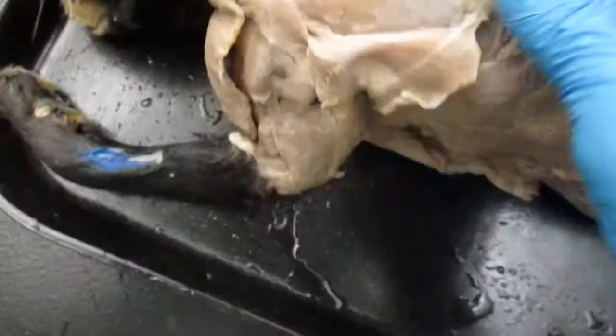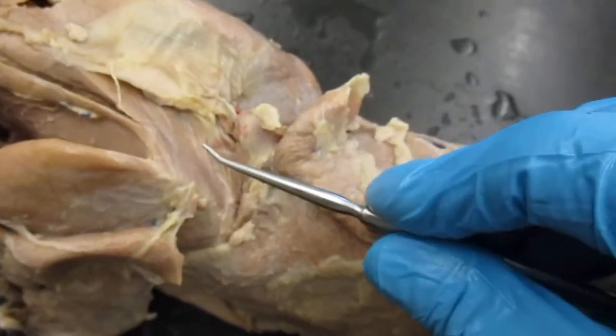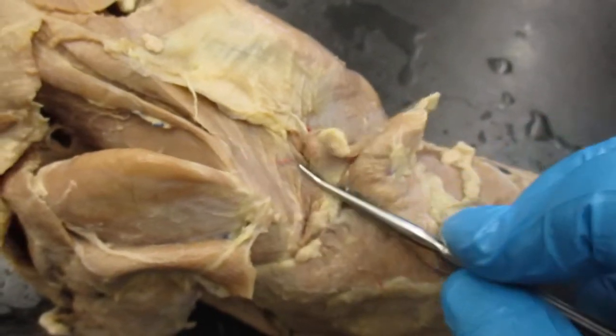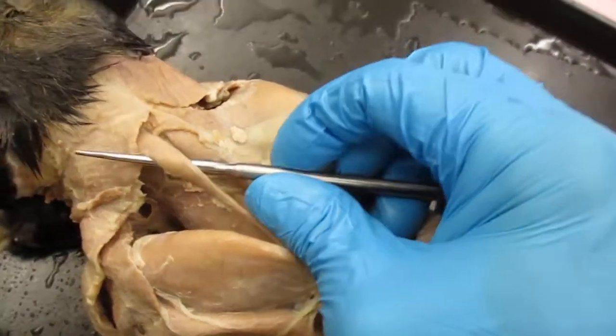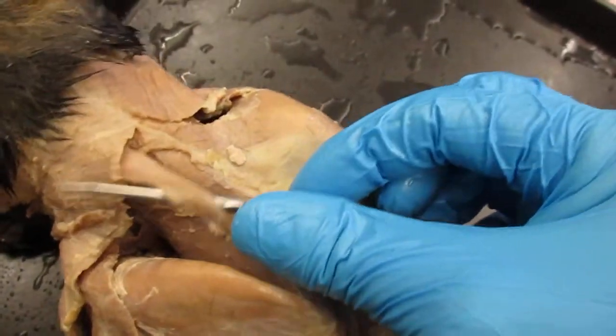Now, I want to show you the rhomboideus muscles. So, you can see the rhomboideus muscles basically underneath your acromial trapezius and spinal trapezius. So, right here we have the rhomboideus muscles. Here we have a muscle called the rhomboideus capitis. Rhomboideus capitis.